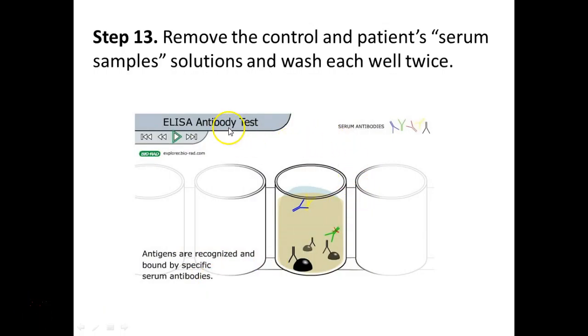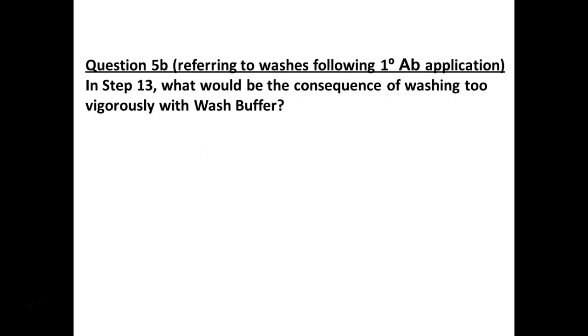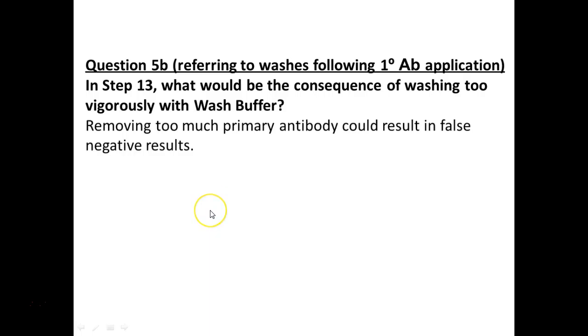Okay, so we're going to wash, right, to remove anything that's not binding. And we're probably at the time where we could do that. We don't want to wash too much, because we'd remove too much stuff and we'd end up with false negatives. And we certainly want to wash enough that we don't leave stuff behind and it doesn't soak up our next reagent that we're going to add.